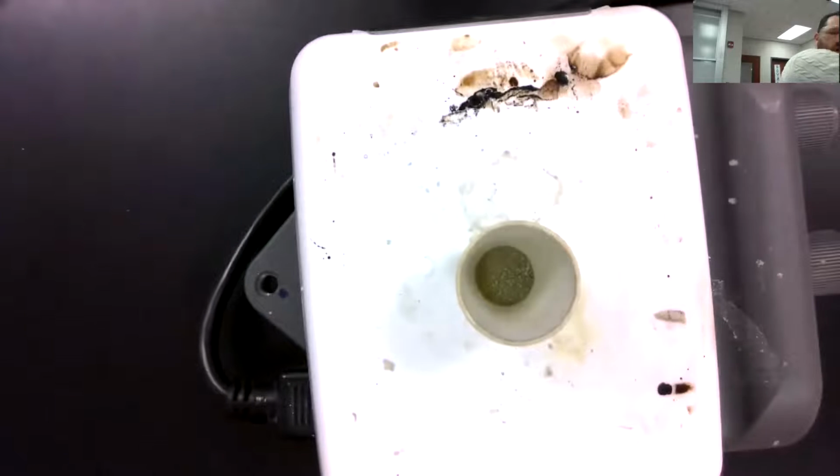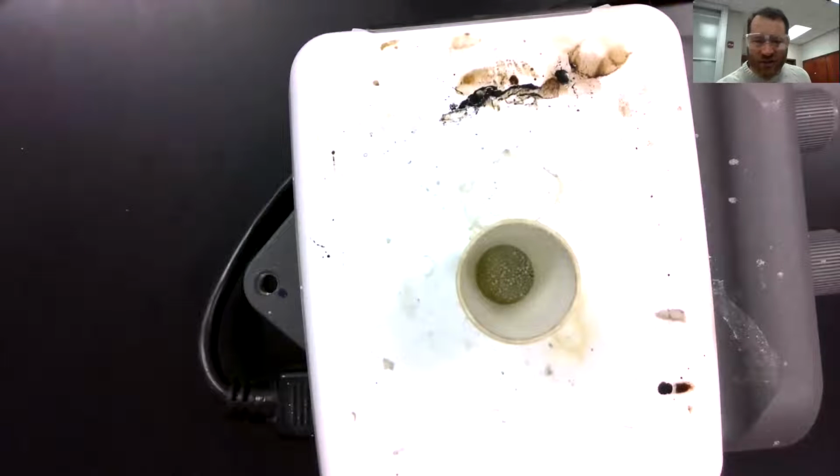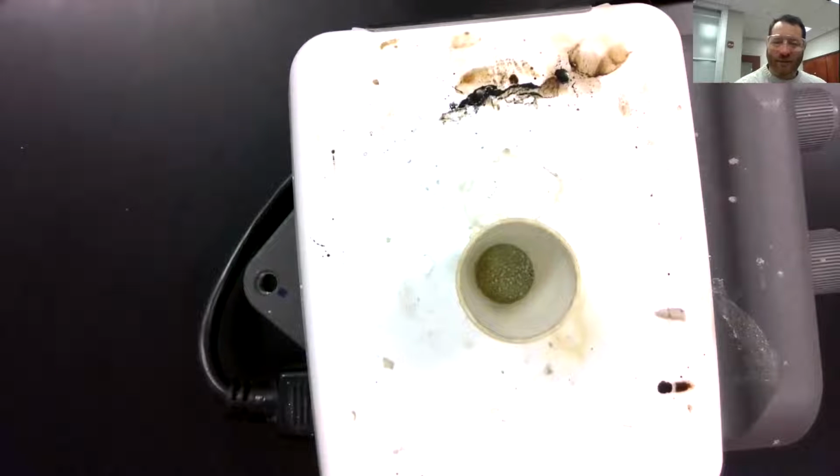Back now. You can already see it's starting to change colors just a little bit. So we'll come back. Hopefully we have a really dark brown color to it. You can see it happening again on the outside left edge. But we'll see in just a minute, when we come back.